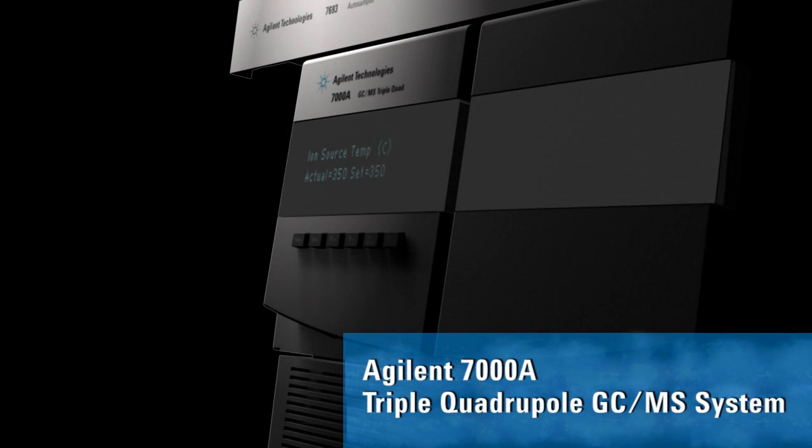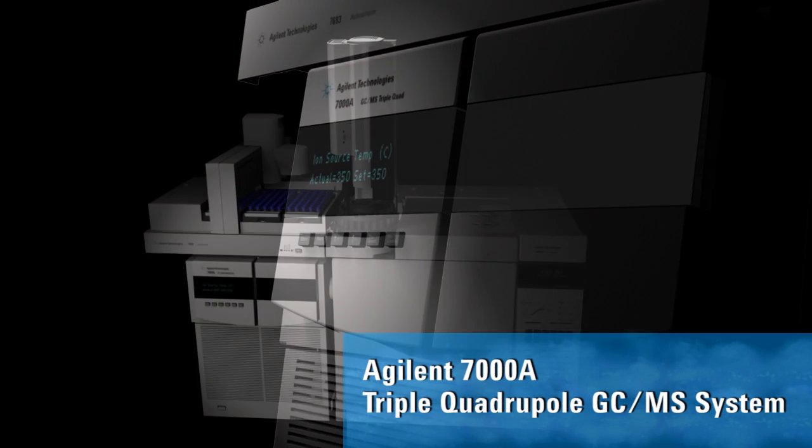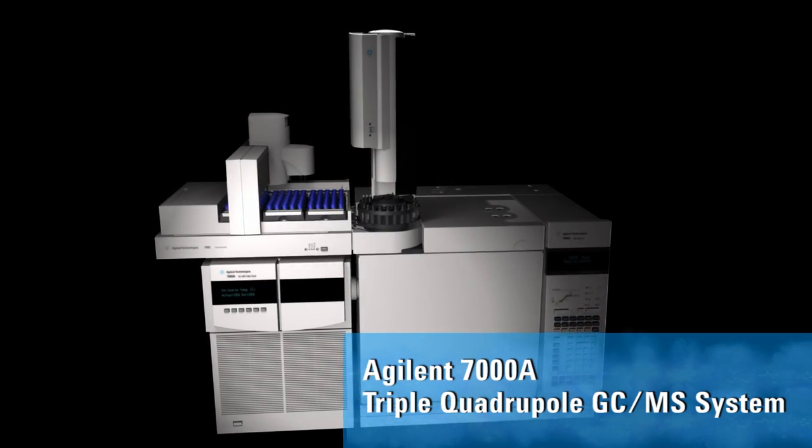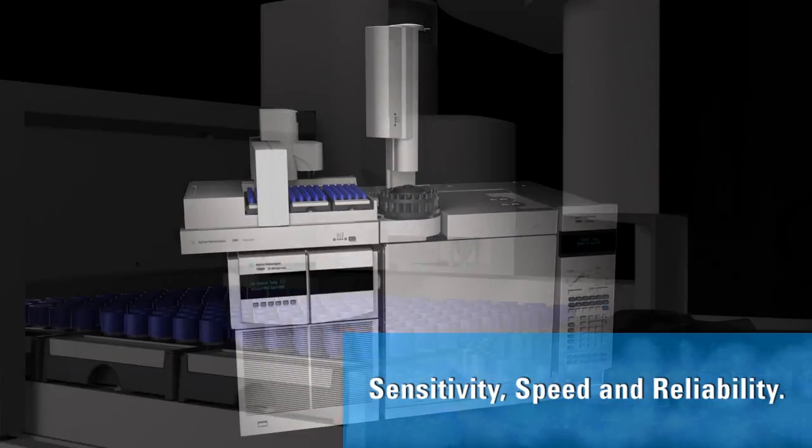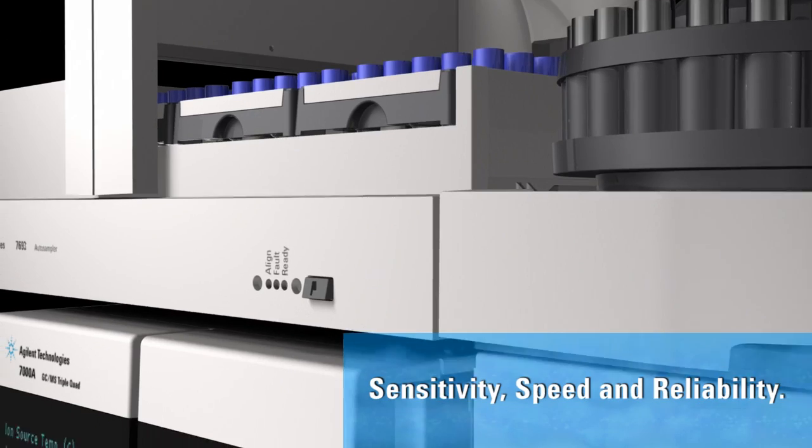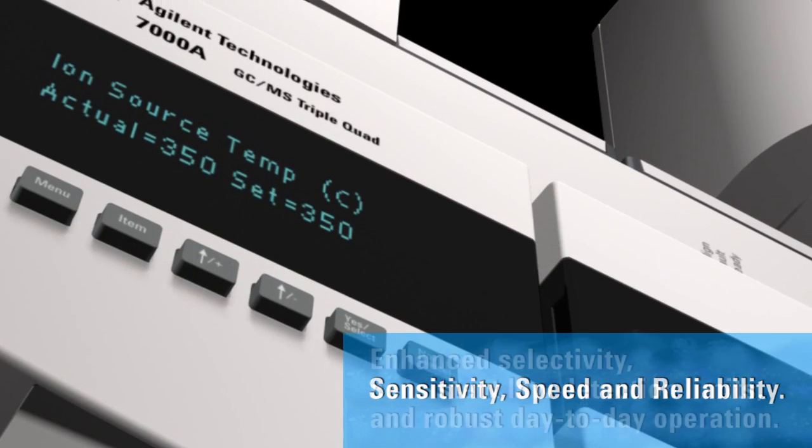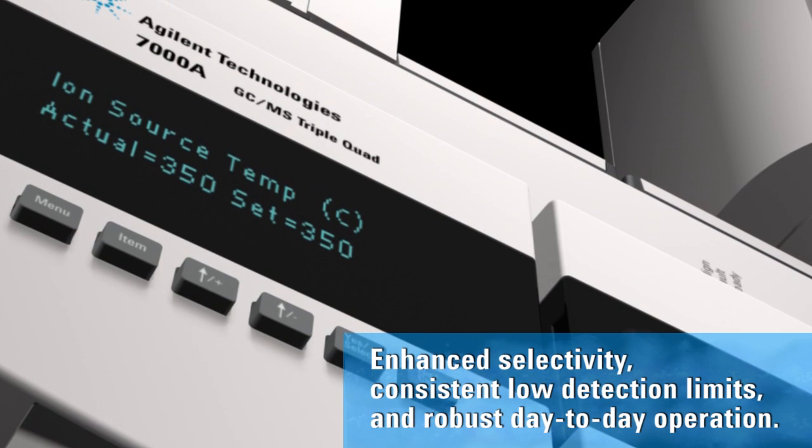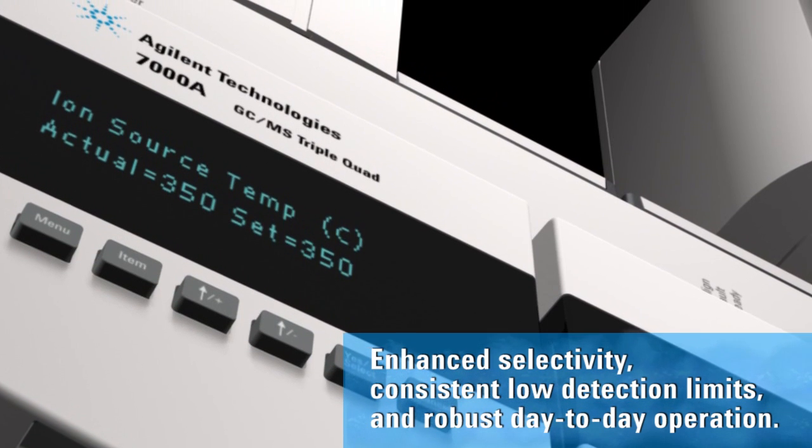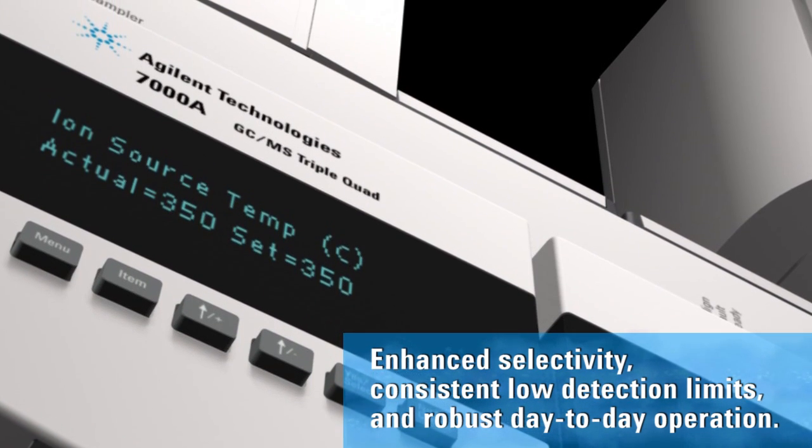The 7000A triple quadrupole GC-MS is the first quadrupole MS-MS system designed specifically for the unique requirements of gas chromatography applications. These requirements include enhanced selectivity, consistent low detection limits, and robust day-to-day operation.